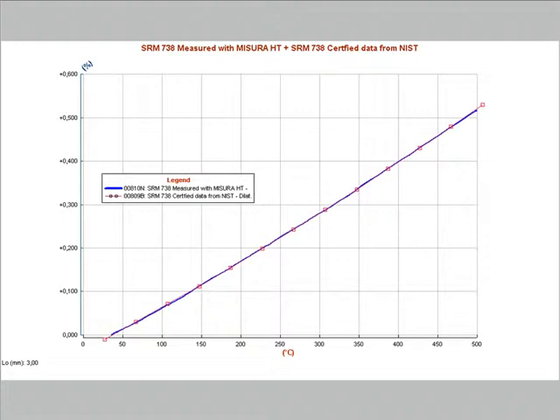In comparison with the data certified by NIST, the red dotted line. Since it is not necessary to correct the curve with the correction curve, it becomes possible to use complex heating and cooling rates during the test. This makes it possible to reproduce industrial firing cycles.